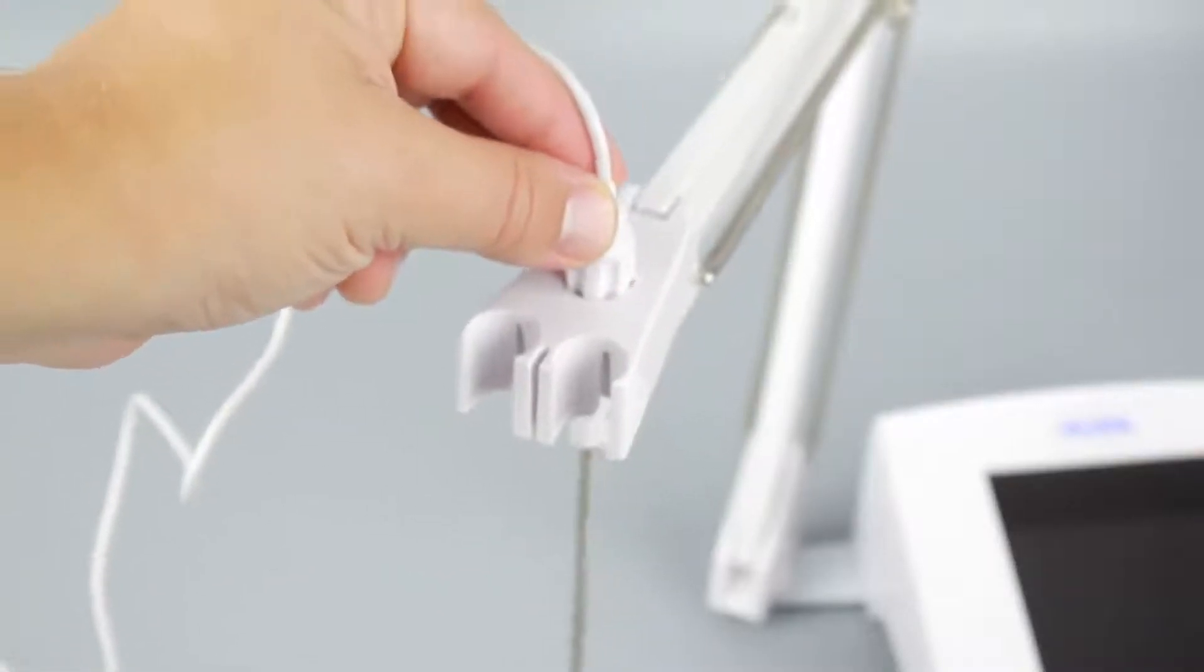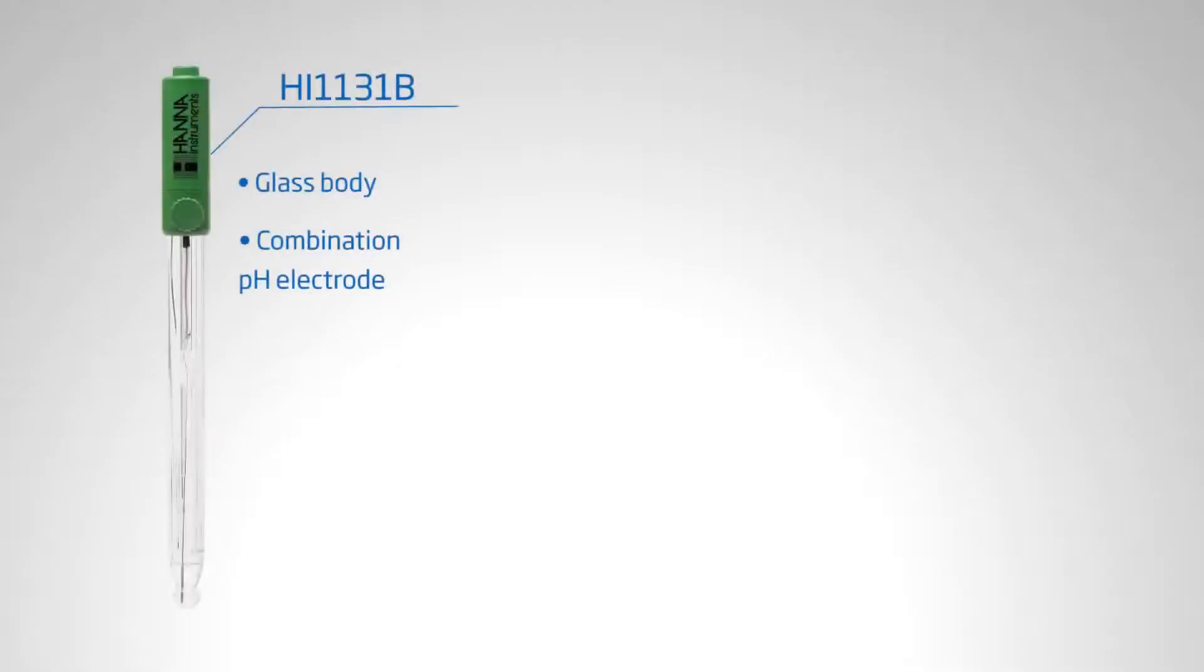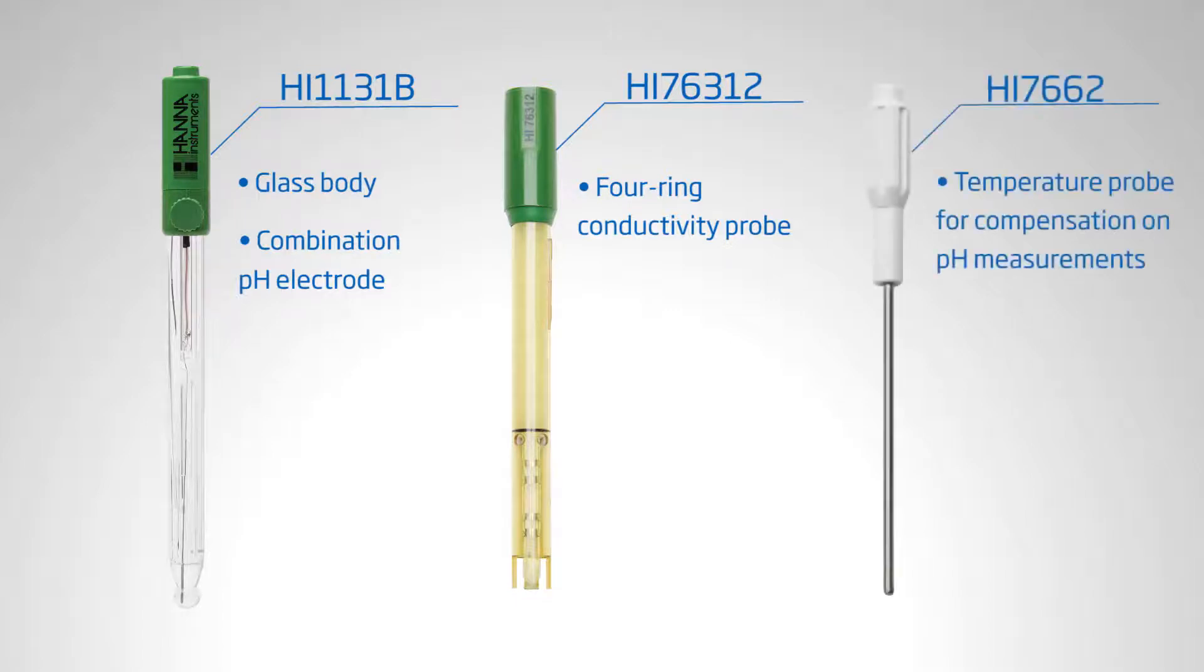To set up your meter, first insert the probe and electrodes into place. The meter is supplied with the HI1131B glass body combination pH electrode and HI76312 four-ring conductivity probe. You'll also find the HI7662 temperature probe for compensation on pH measurements.